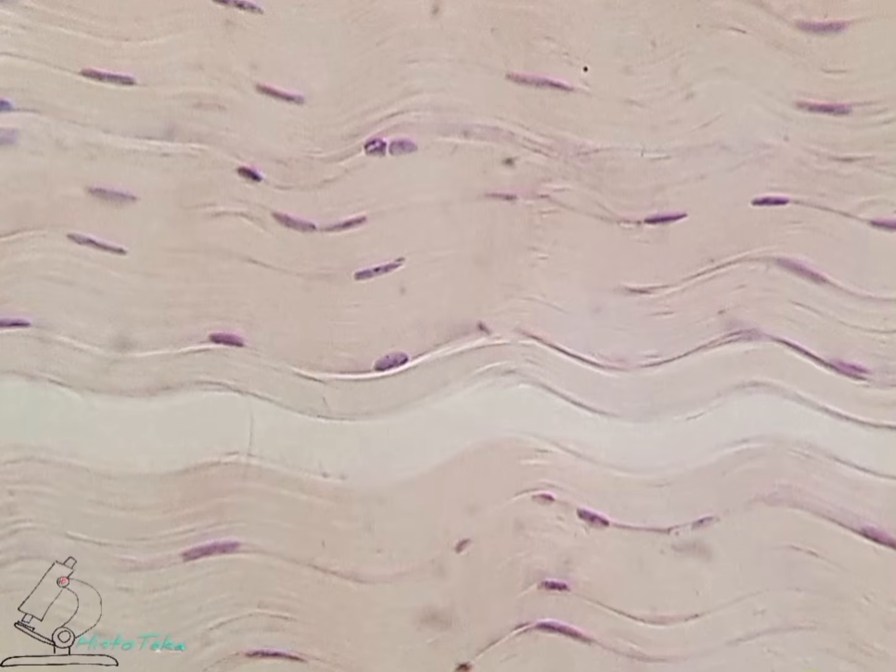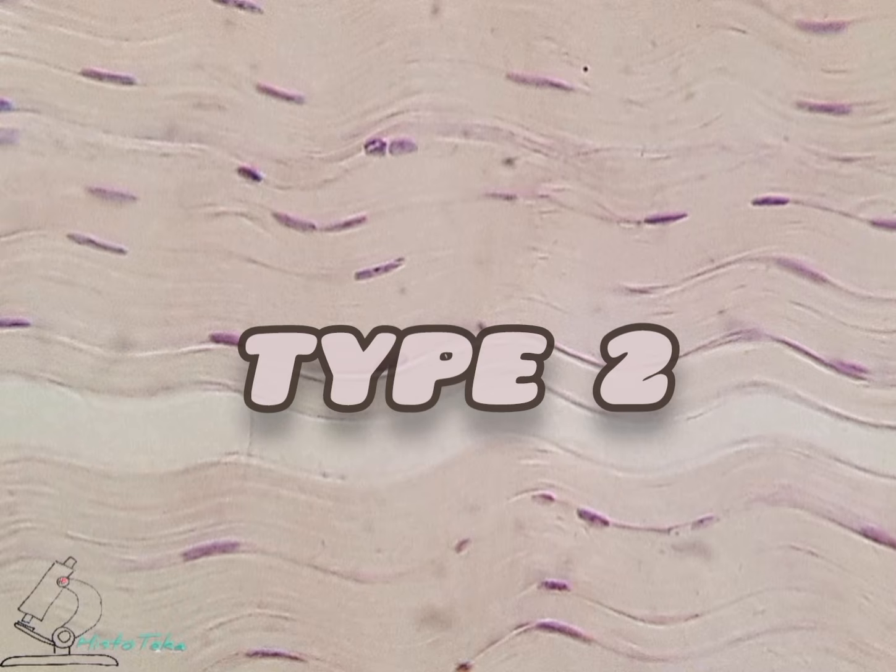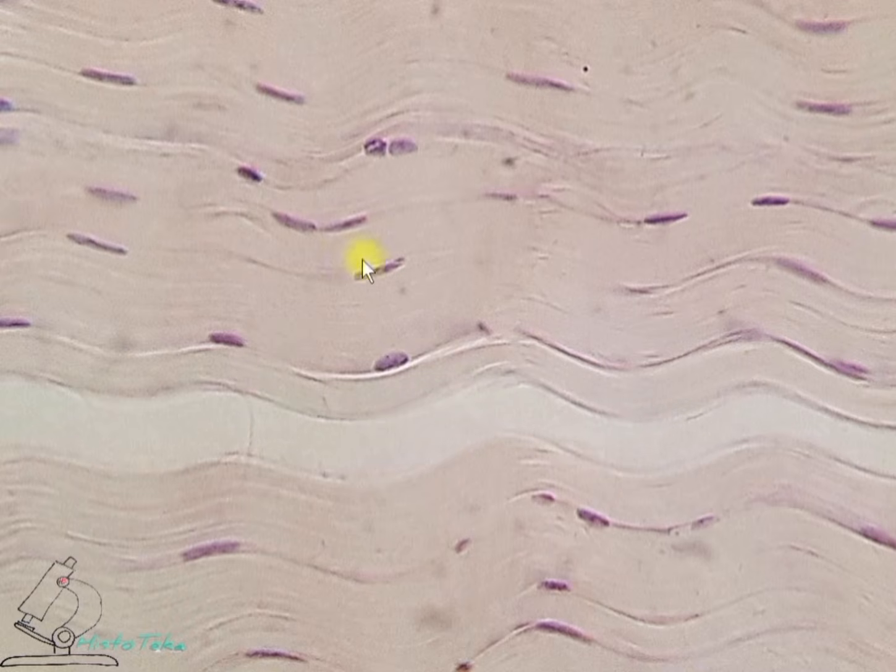Regarding bundles of collagen fibers, there are 4 types of them: first, second, third, and fourth type. Bundles of the first type are collagen fibers separated only by tenocytes. At high magnification, it is necessary to find tenocytes and bundles of first type between them.